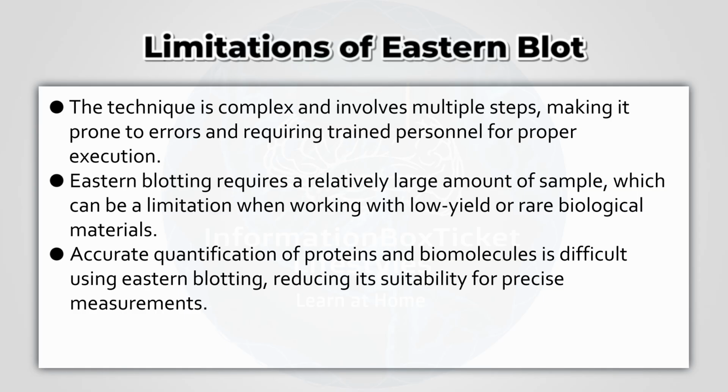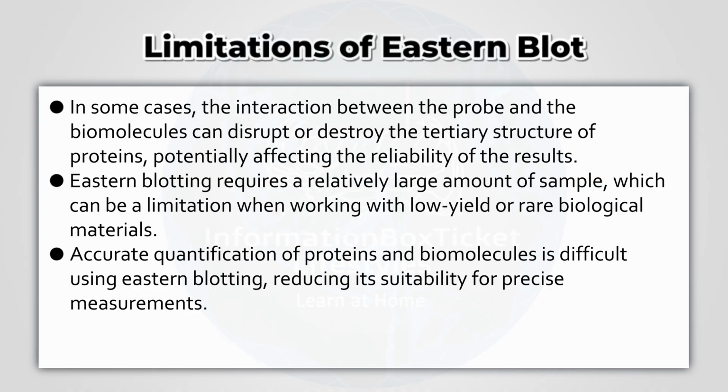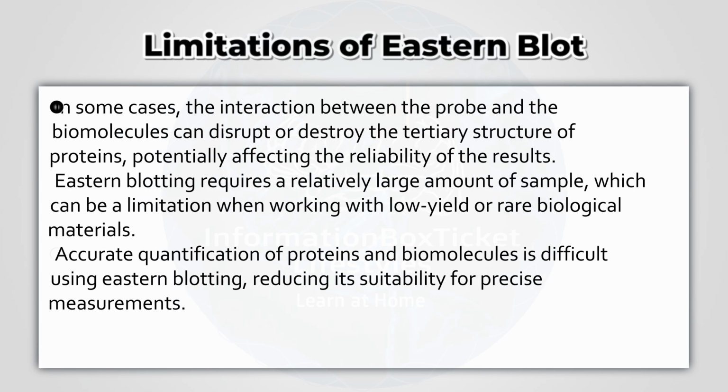reducing its suitability for precise measurements. In some cases, the interaction between the probe and the biomolecules can disrupt or destroy the tertiary structure of proteins, potentially affecting the reliability of the results.